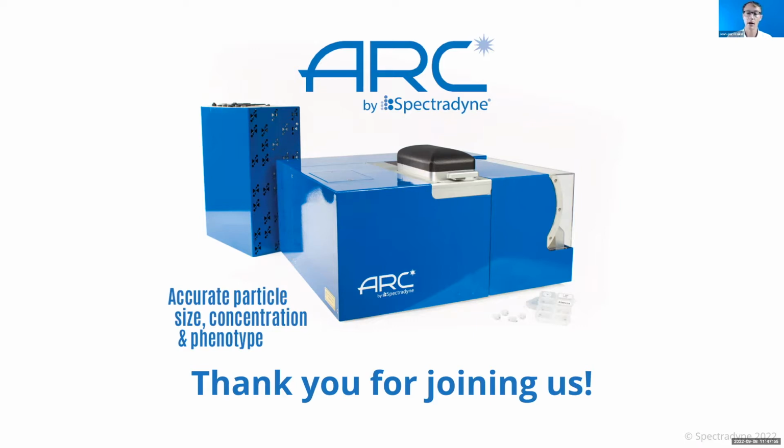But because they're not actual physical particles to be detected by MRPS above 50 nanometers volume, we will not be seeing those and they won't contaminate the data. That's a powerful deliverable that the MRPS technology brings for the particle detection. I hope that answers your question.